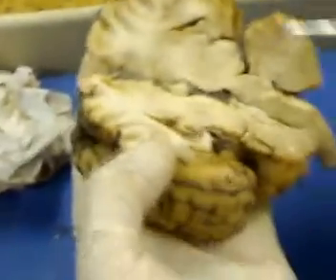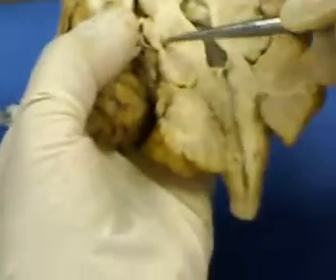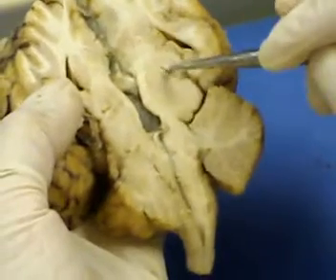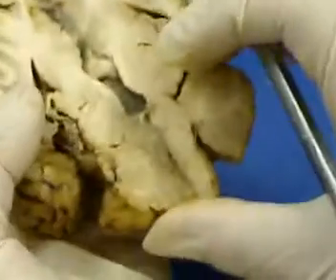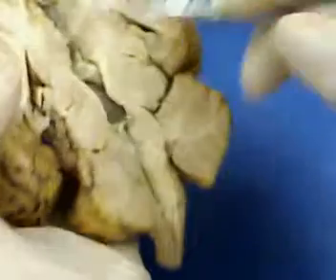Third ventricle. Now third ventricle is my cut. This is thalamus, and it is here. My cut is not very good. And here. Too much fat in there. This is thalamus. Just a minute. No. I think no. This is corpora quadrigemina.